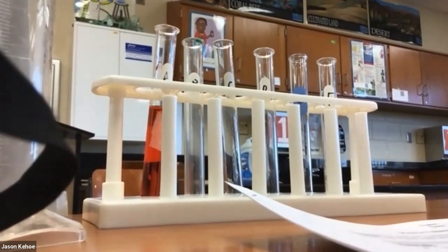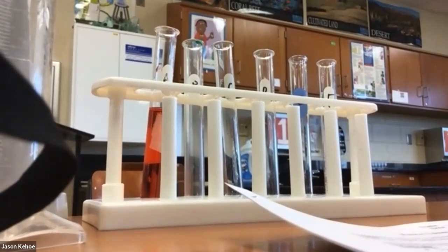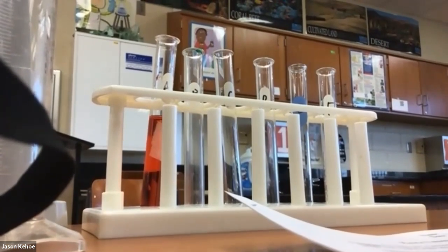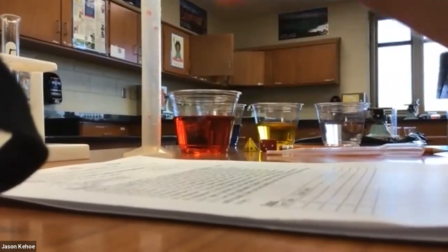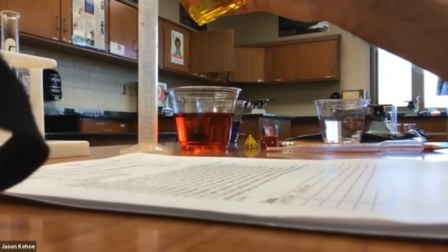Okay. Measure 10.5 milliliters. I'm going to tap out the excess liquid. There's still a little in there, but so be it. Measure 10.5 milliliters of yellow water from the beaker and put it into test tube C. So now I need 10.5. This is going to be one small line above the 10.